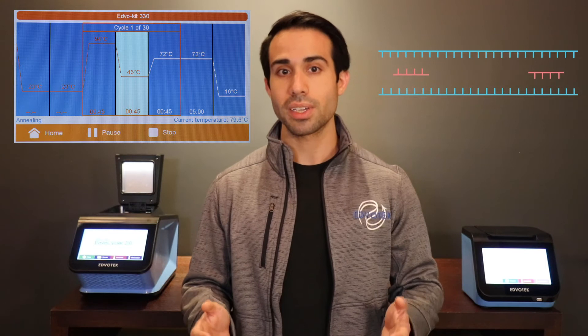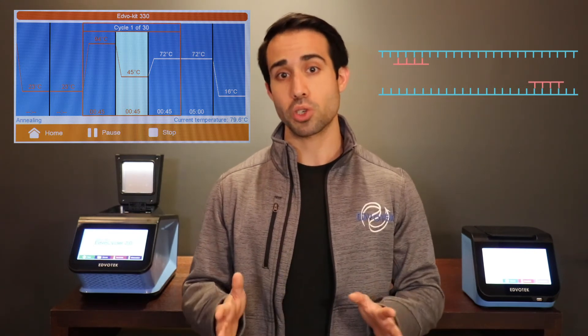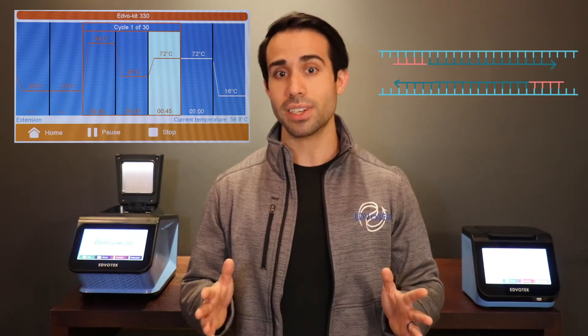Step two is annealing, where the reaction is cooled so that the primers can bind their complementary sequences on a single strand of DNA template. Step three is extension, where the reaction temperature is raised again so the Taq polymerase can extend the primers, synthesizing new strands of DNA.